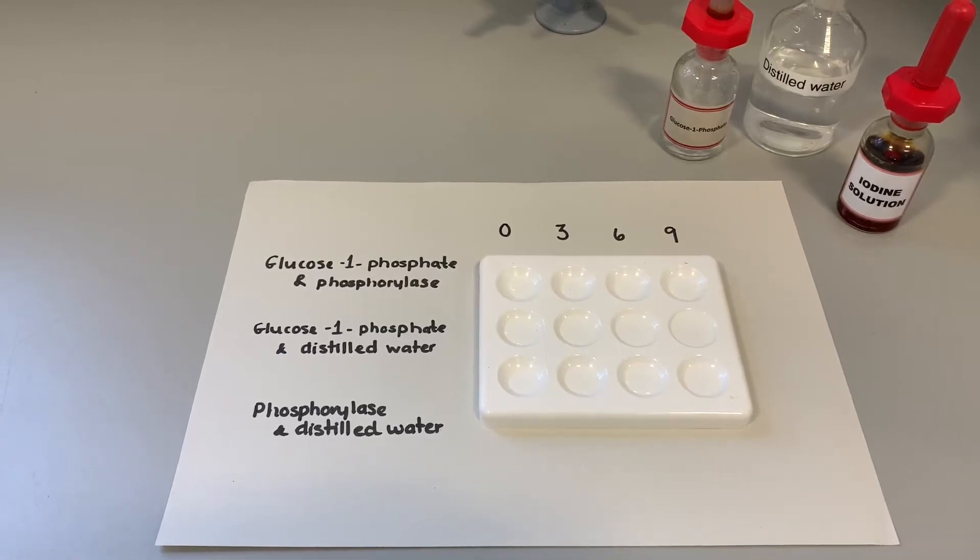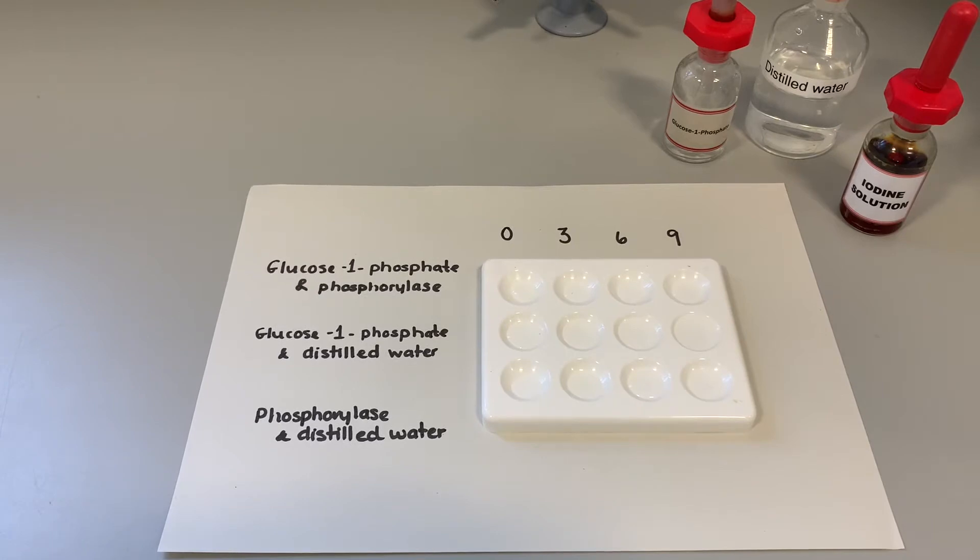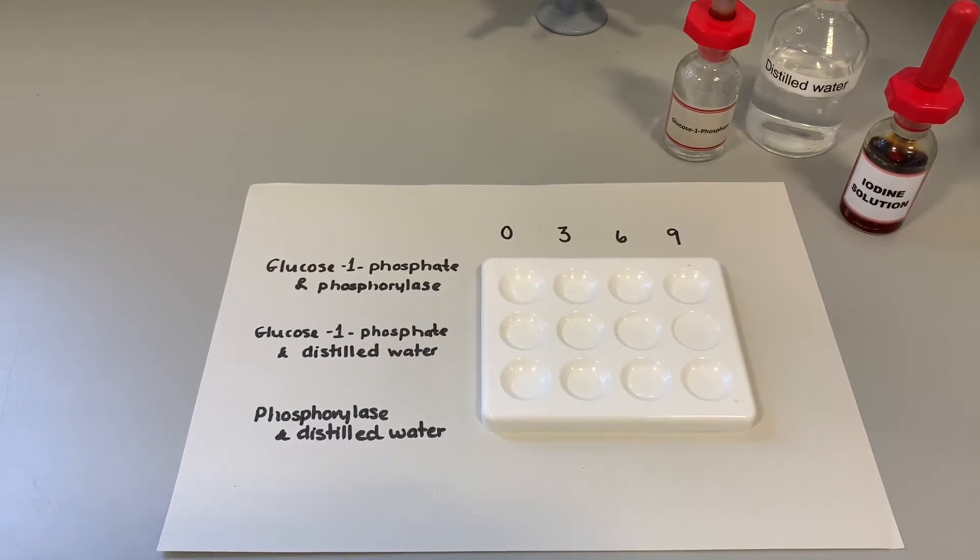In this experiment we're going to be investigating the effect of the enzyme phosphorylase on glucose 1-phosphate. Phosphorylase is what we call a synthesis enzyme. It joins small molecules together to make larger ones, and phosphorylase should join glucose 1-phosphate molecules together to form starch.